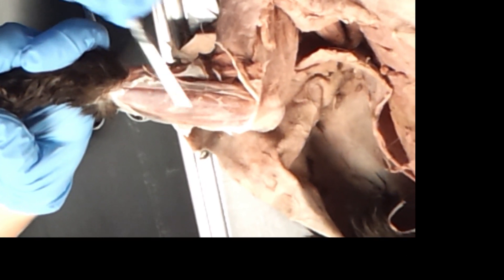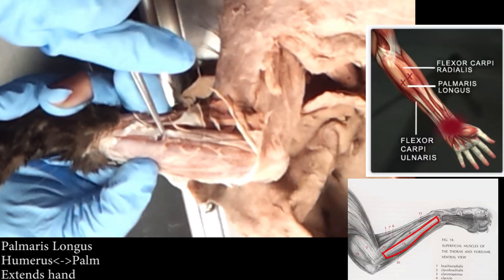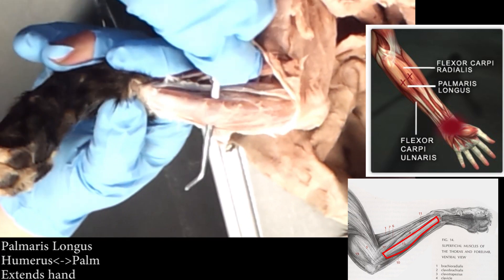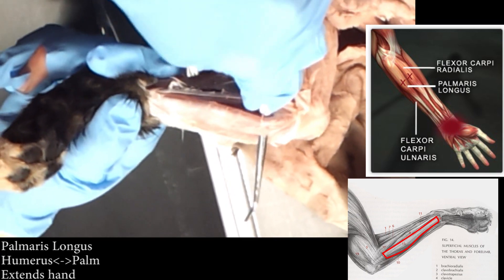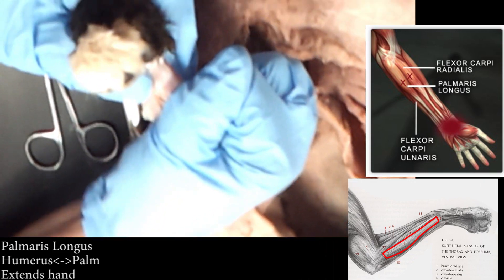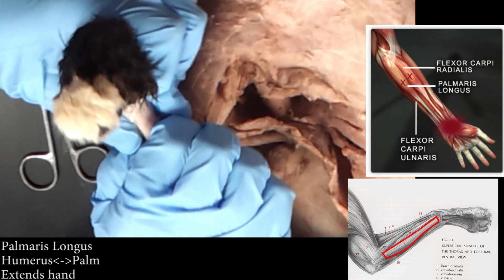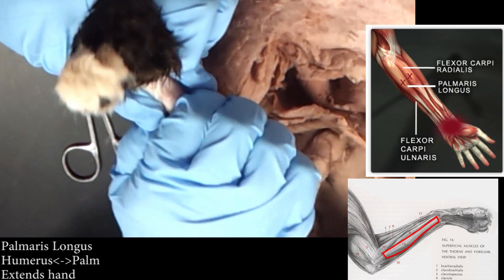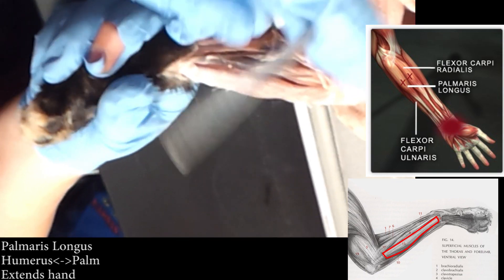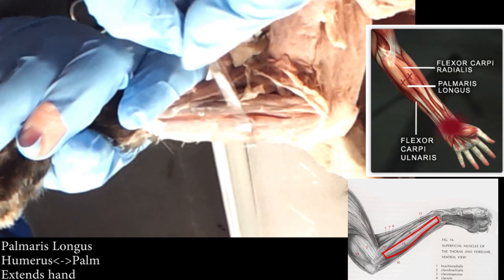So this pretty muscle in the center — it's a really big muscle — it's called palmaris longus. I always find it first. And you can loosen it up. What's really cool is that it's palmaris longus, so it's what flexes in the paw. If you tug it, you can actually make the cat's paw move. So that's kind of neat. It's always got a little bit of a sheen to it from the layers and layers of fascia.